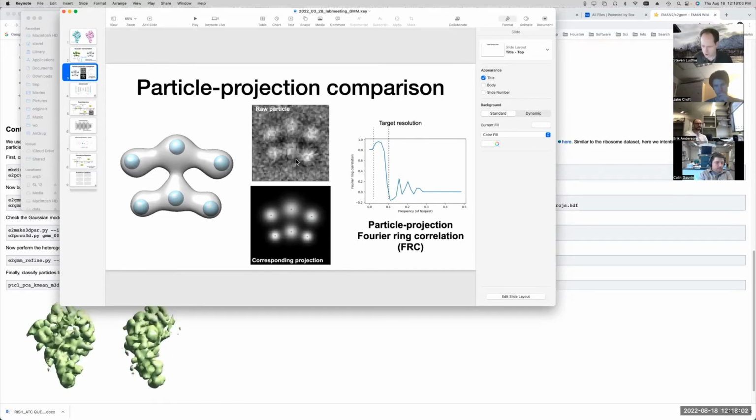So there are 2 strategies for doing that. There is one strategy which will sort of deterministically find centers for things. And there's another strategy, sort of an energy minimization thing, which will find the 5 Gaussians which will most completely represent the volume. Gotcha. Obviously no representation is going to be a perfect representation, but you can do an energy minimization using this kind of strategy, but in 3D, to find the set of Gaussians which would best match. That's not the strategy that we're typically using here, and I'll get to that.